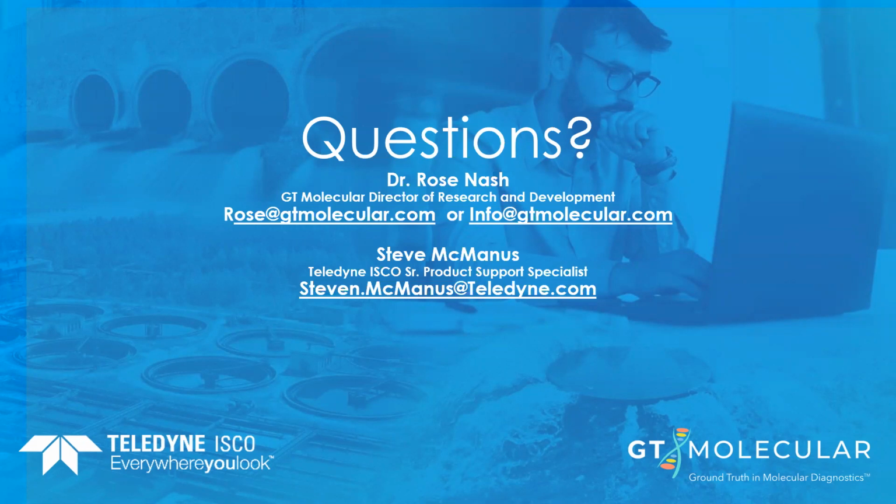There's all kinds of great tools coming out and mathematical models that I think will be published in the near future. The Centers for Disease Control is working on this harmonized model that I think a lot of us will start using, that takes into account a lot of those assumptions that I discussed in the webinar around the loss of signal as it travels through the sewer, and the differentiation from day to day of how much virus is actually shed in waste. So there's a lot of new analytical tools that will be coming online, I think, soon. But right now, we're relying on that published method from Curtis et al. and recommending to our customers to use this data to monitor trends over time.